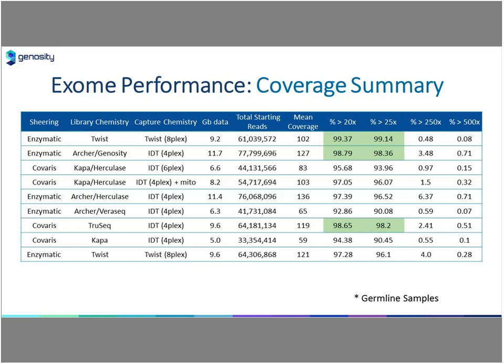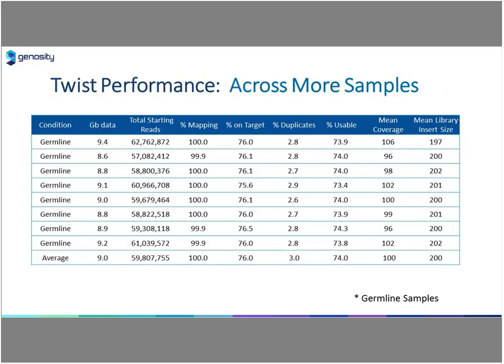So when we look at 20x coverage or 25x coverage, these were the conditions that provided us with that type of overall coverage. And so for anyone who's been doing exome sequencing and has watched the evolution of this, we were once upon a time happy with 85, 90% of the target region covered to that 20x mark. Pushing to 95% is really kind of earth-shattering. And now to begin thinking about an off-the-shelf kit that could actually hit 99% is pretty amazing.